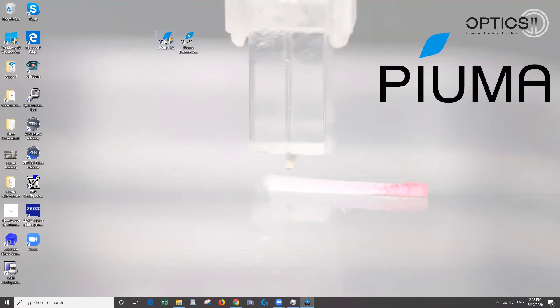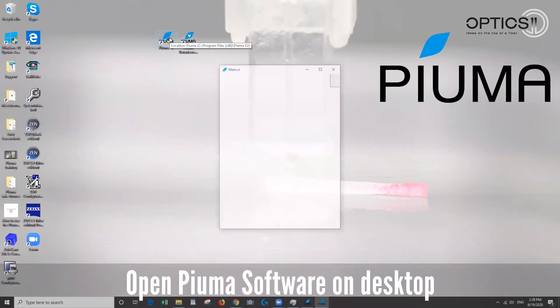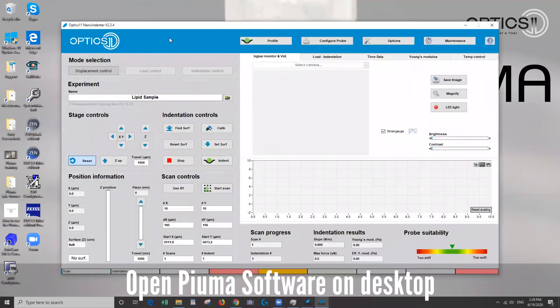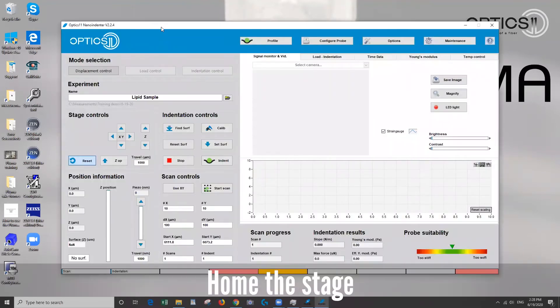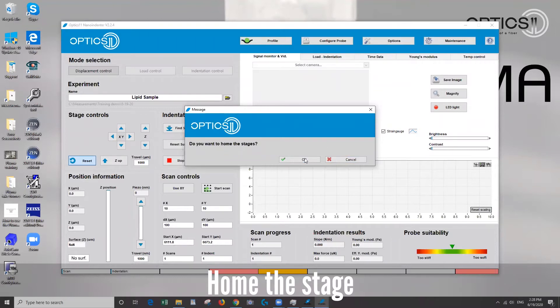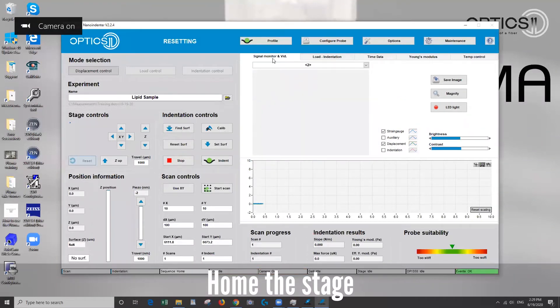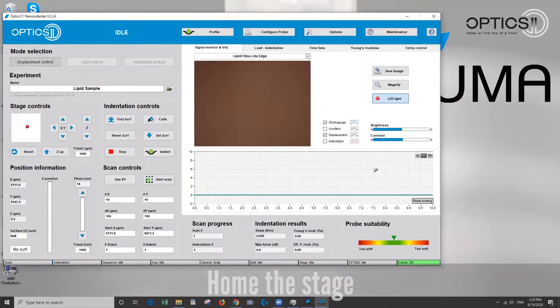So first let's go ahead and open up the software. Okay, so the first thing it's going to ask you to do is do you want to home the stage? So usually we'll say yes.